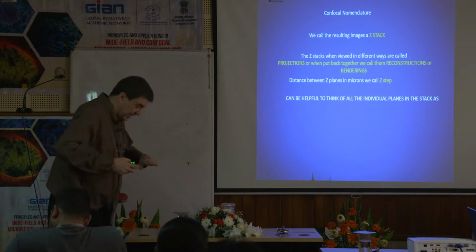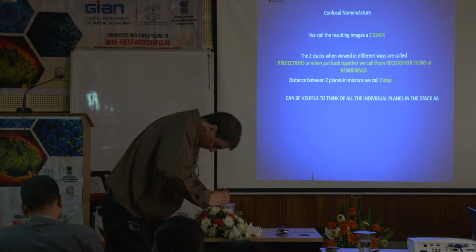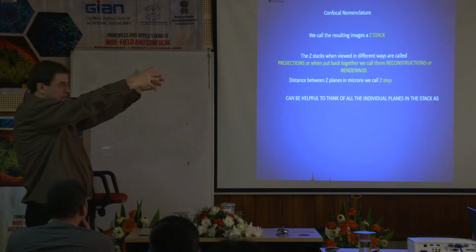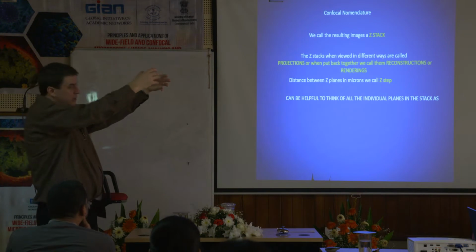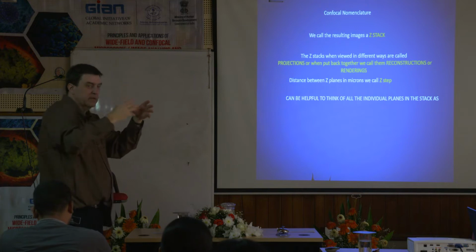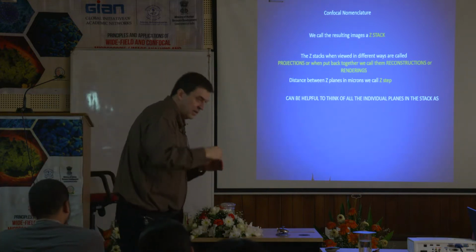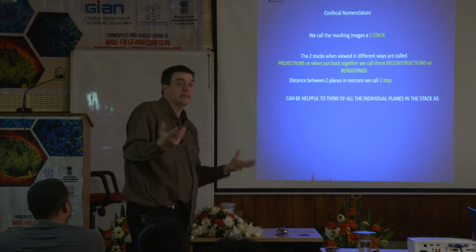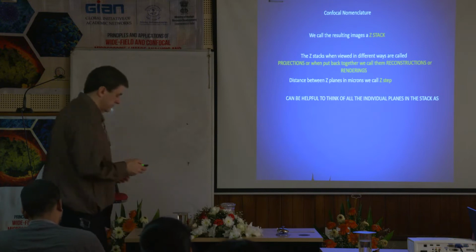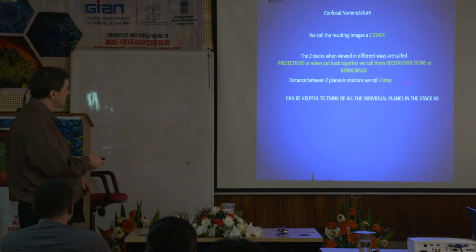Different projections, because you can look at it from different angles. You can look at the ball from the top, from the side, or from the bottom. You can look at the ball numerous different ways. Those are all called projections, depending on the angle you want to look at the ball to get the information you need from it. And like we just talked about in terms of the overlap, that's called the step size.